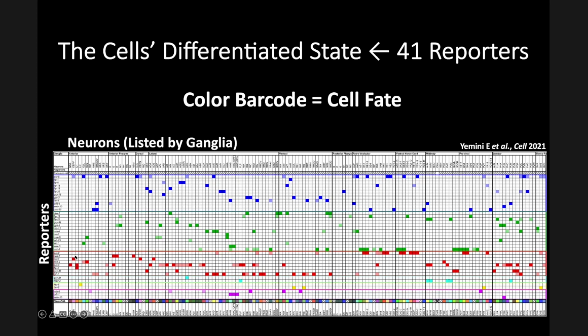And if we bring in a transcription factor mutant, and we, for example, see that this neuron loses one of its colors, right? It loses blue or red. We know exactly what gene it no longer expresses, right? And we know the identity or the fate change that's taken place, right? What has changed about this neuron? And we can do that for all these different neurons when we lose coloring. And if we gain coloring, we can even hypothesize about what gene might now be expressed in that neuron.